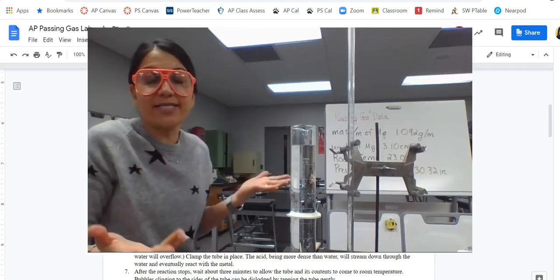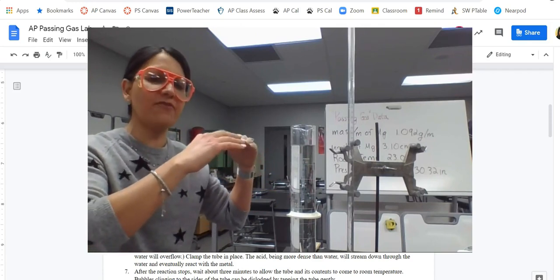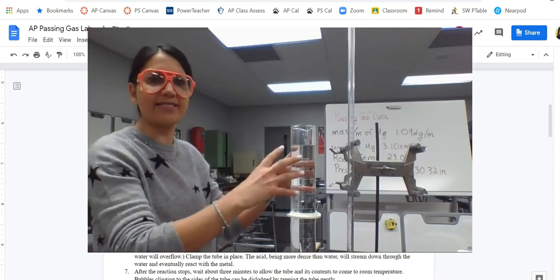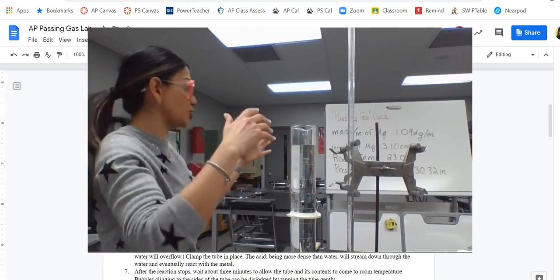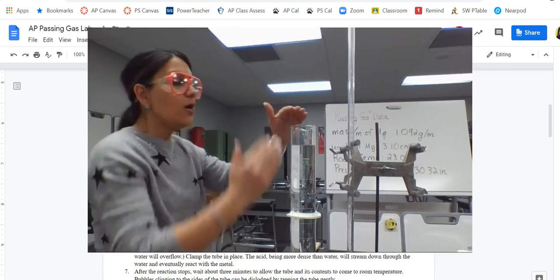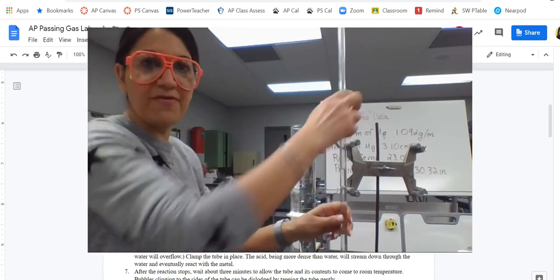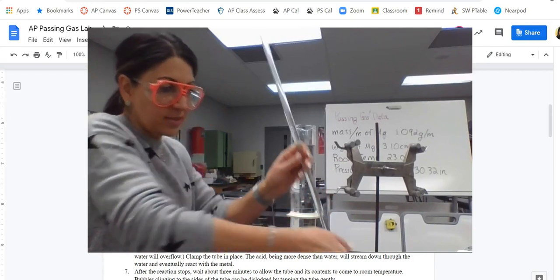Well, some of it is. That's evaporation. Any of the molecules at the surface that can gain enough energy to take off, they will. The water molecules that are staying inside of here are staying because those air molecules, the room pressure, that value that we recorded, are pushing down on there. Well, the water is pushing up against it, okay? So what we're going to do is take this, and I need to put my finger down back where the hole was again so that it doesn't come out of there, okay?